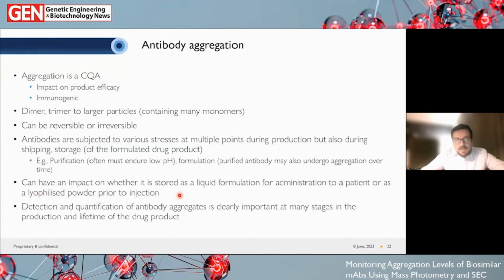Where the introduction or injection of antibody therapeutics is concerned, the majority are introduced intravenously, but more antibody therapies are being introduced subcutaneously. That often necessitates formulating the antibody at a very high concentration to introduce it in a smaller volume. Formulating at a higher concentration comes with the risk of more antibody molecules being present, more likely to be bumping into each other, which again increases the risk of aggregation.